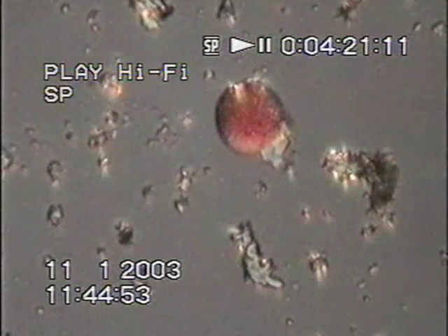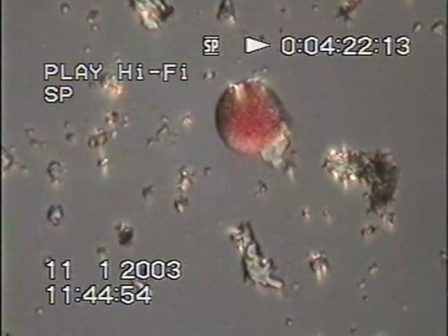On the 11th of January, crystals, condensation of droplets, and this is showing the effects of polarized light, which I've normally used anyway. This is the first time I've seen definite effects of polarization.